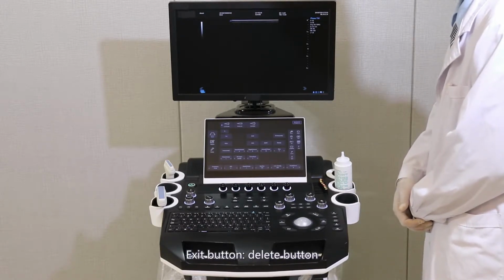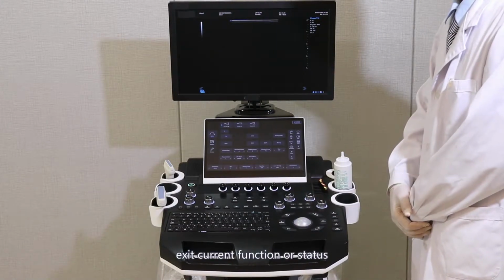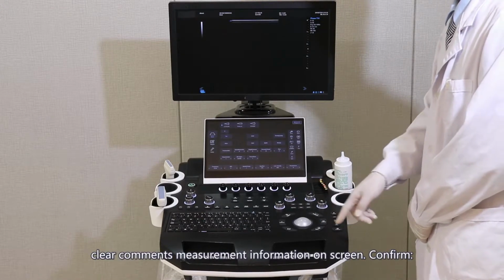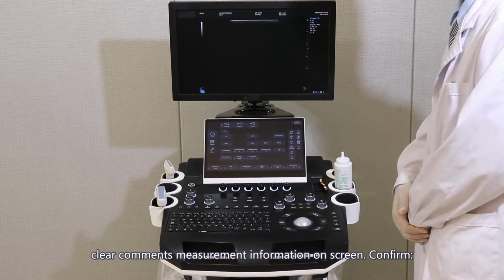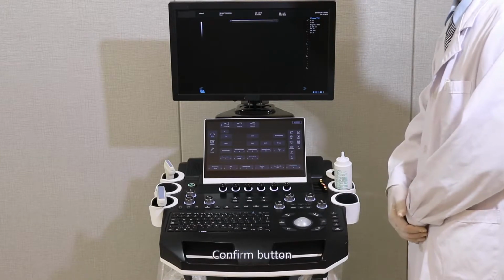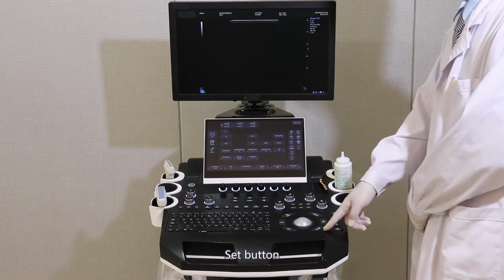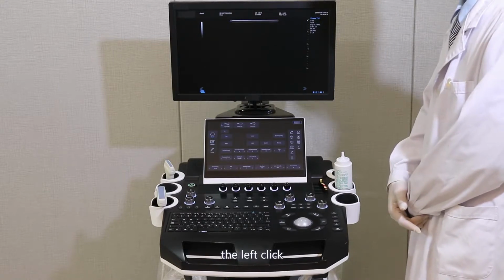Exit button. Delete button. Exit the current function or status. Clear button. Clear comments and measurement information on the screen. Confirm. The confirm button is equal to the left click. The set button is used to confirm, equal to the left click.